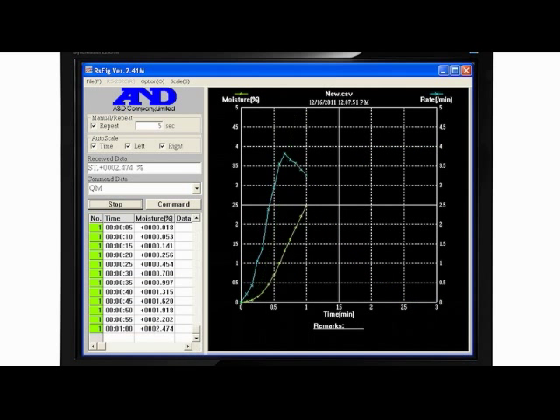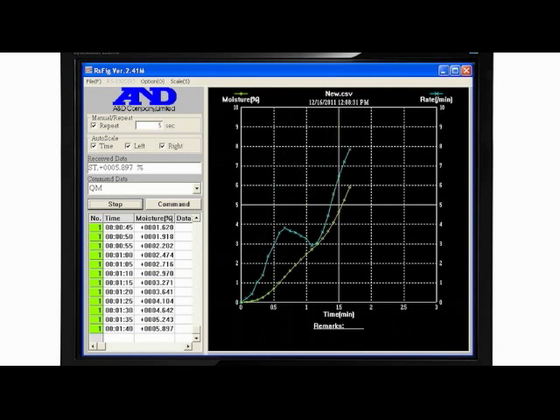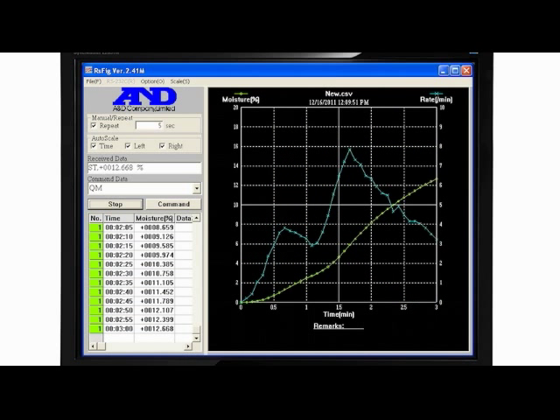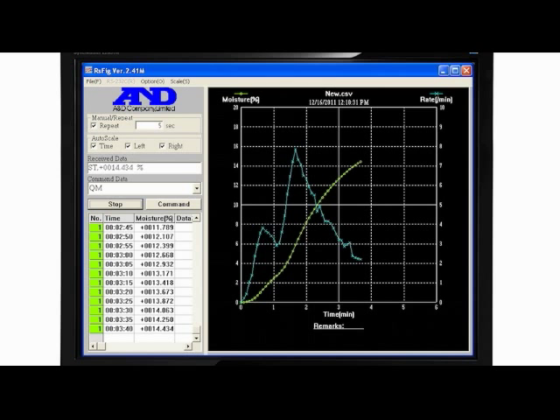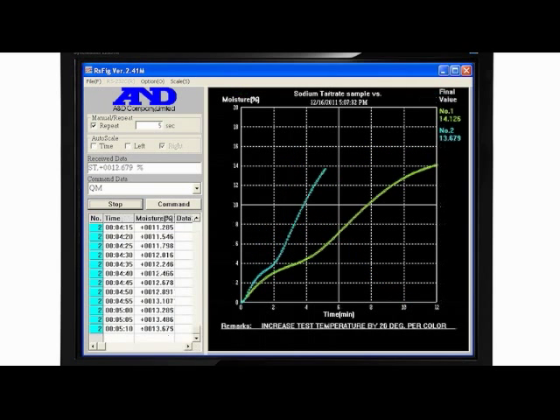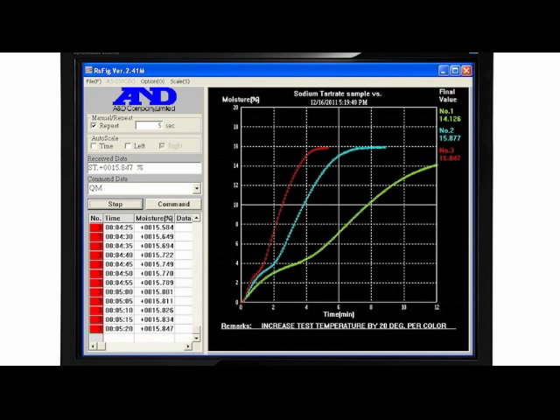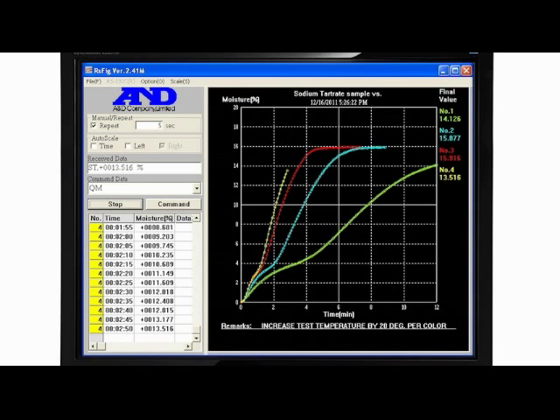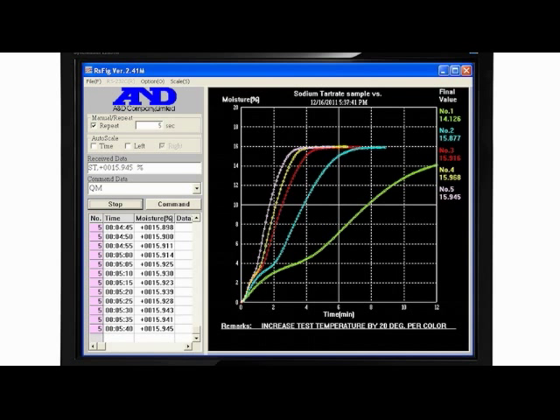Here WinCT plots moisture content as it reaches its final value and the change in moisture rate approaches zero, indicating the sample is now dry. Successive measurements at different temperatures are graphed in different colors.